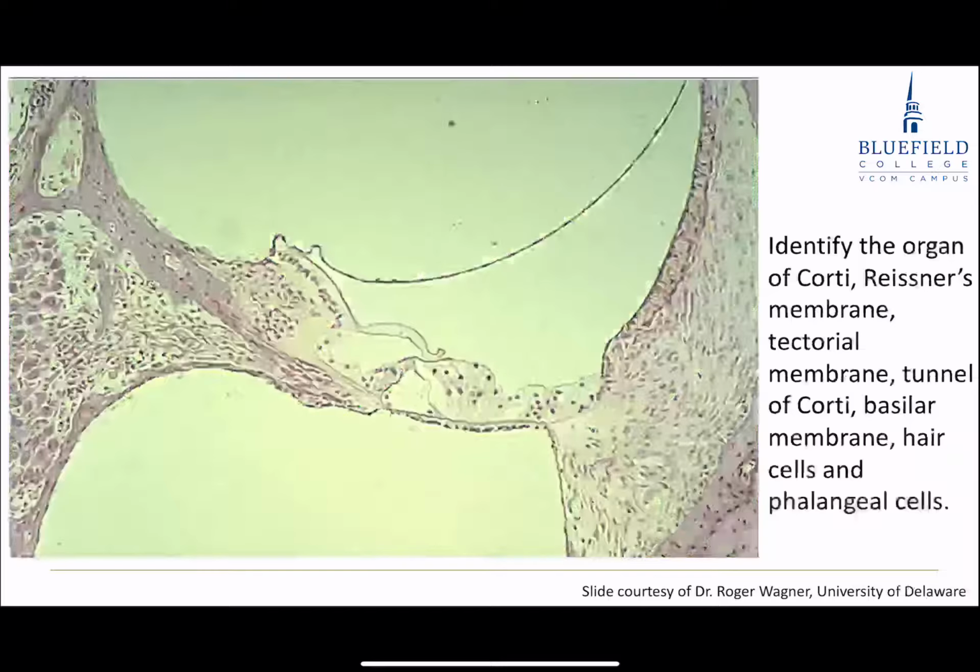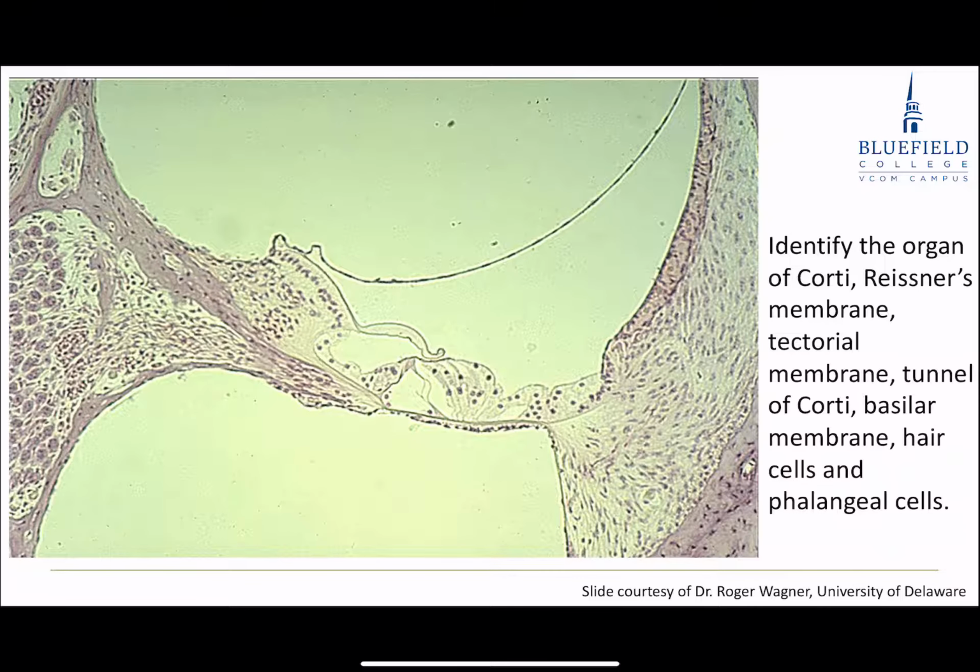Okay. Here's my stria vascularis that makes the endolymph that fills scala media. Over here, on the very left edge of the screen, I can make out large cells, being my spiral ganglia. Okay? That's showing us all the things we need of our organ of Corti.